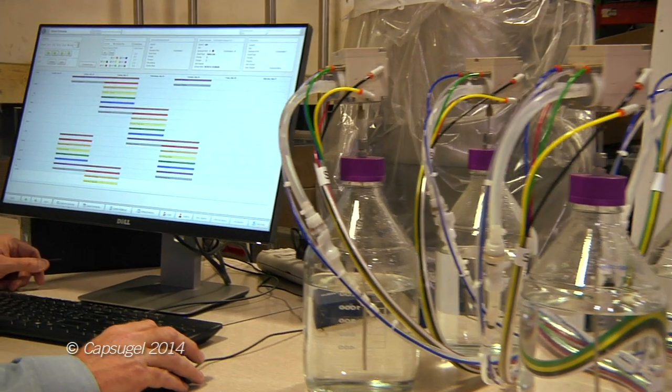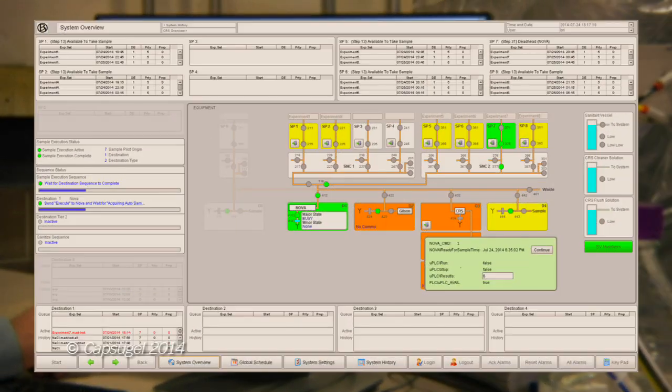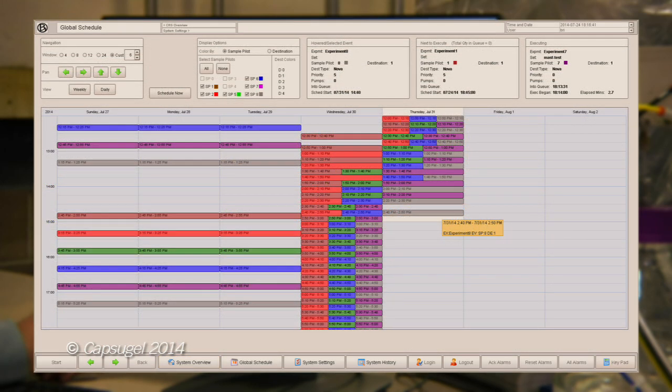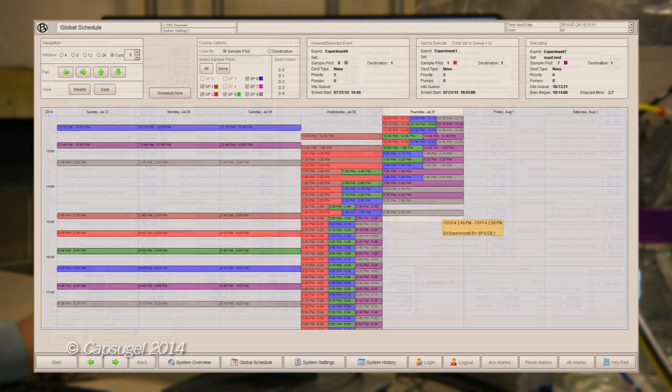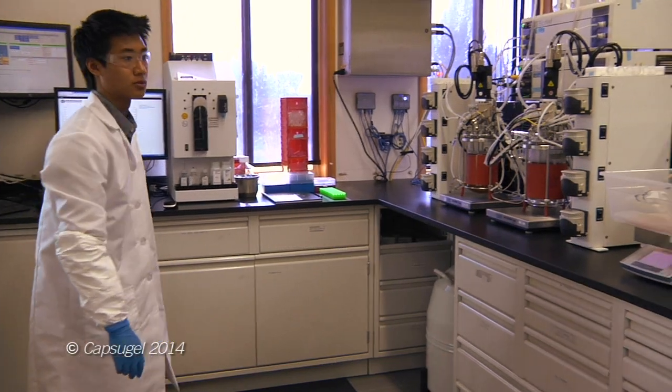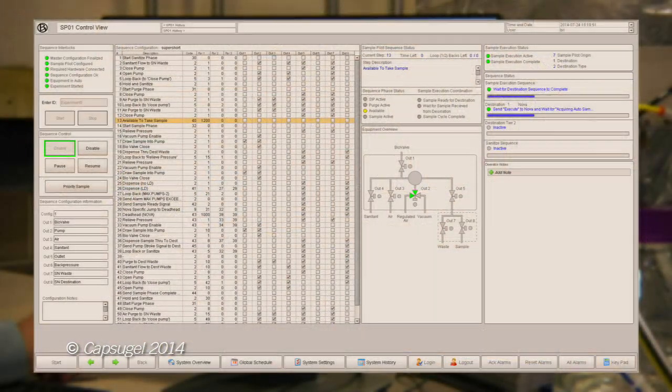With MAST, scheduling sampling activities is straightforward. At a glance, you can see the status of all the sample pilots and the downstream analytical destinations. Using the Outlook style utility, scheduling is easy. With just a few clicks, samples for all the reactors can be created for the entire run. If you like, you can walk up and take a priority sample at any time. Each sample pilot can be enabled independently, allowing the bioreactors to be started and stopped on your schedule.